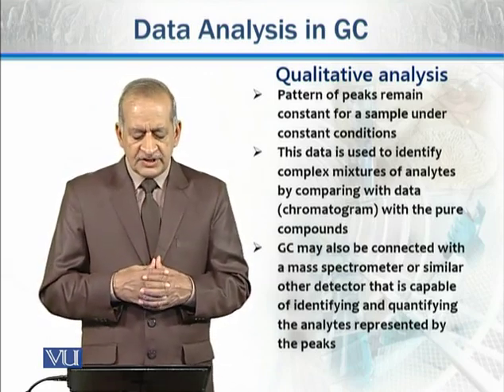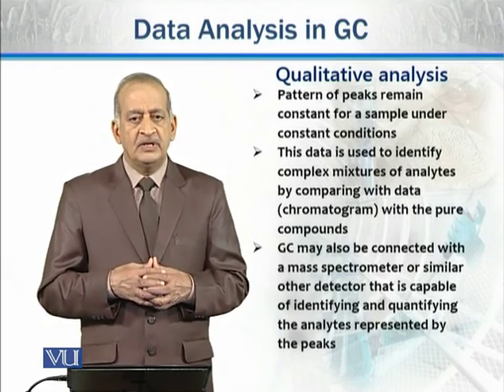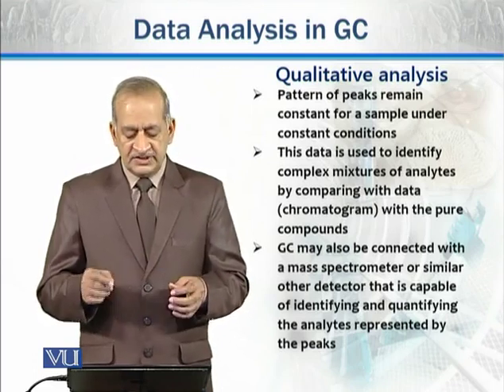GC may also be connected with a mass spectrometer or a similar detector that is capable of identifying and quantifying analytes represented by the peaks.